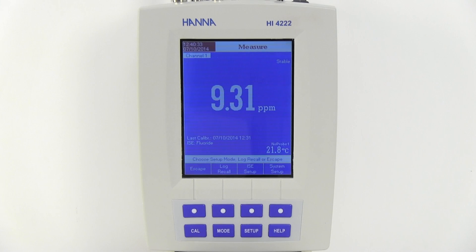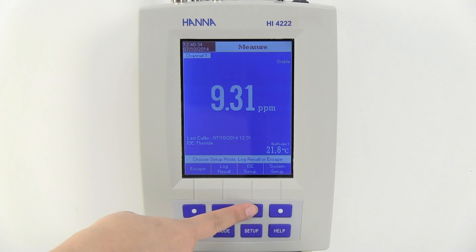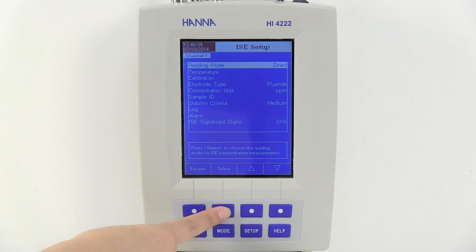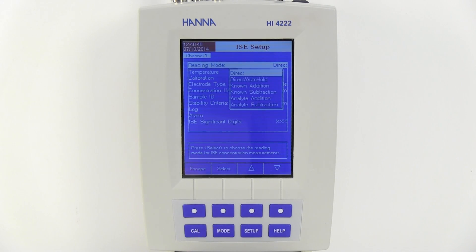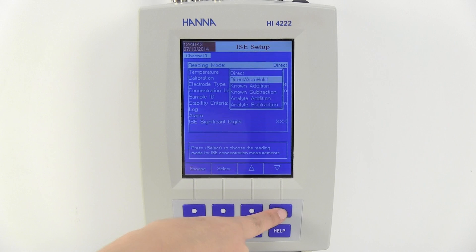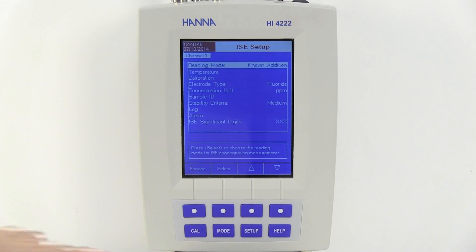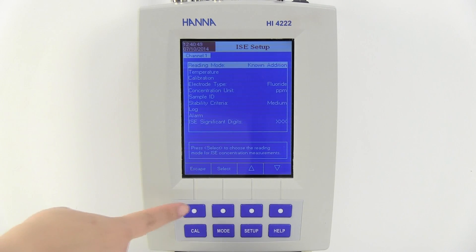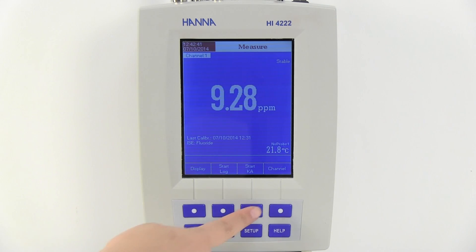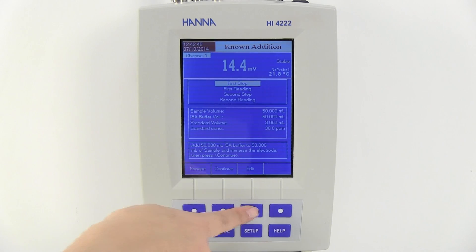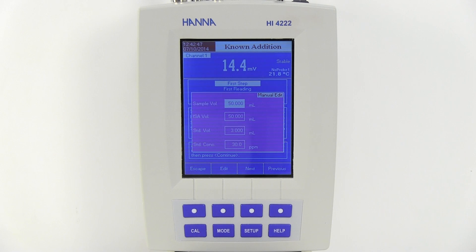On the meter, we can activate the program by simply going to ISE setup and selecting reading mode. Here we can choose between direct measurement or one of four incremental methods available. Once the known addition method has been selected, we can start the measurement by pressing Start KA.